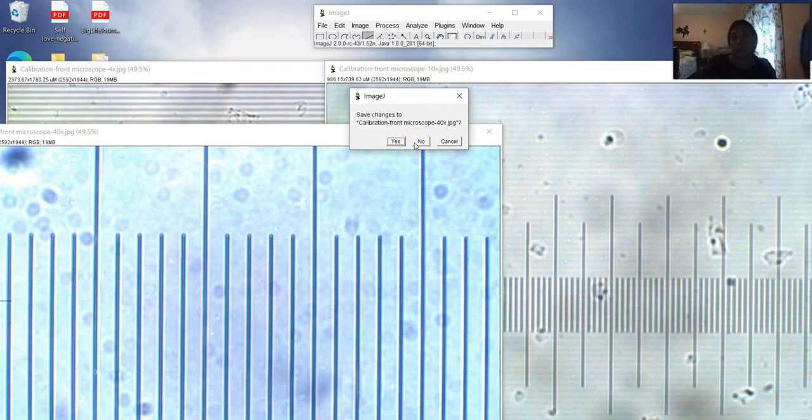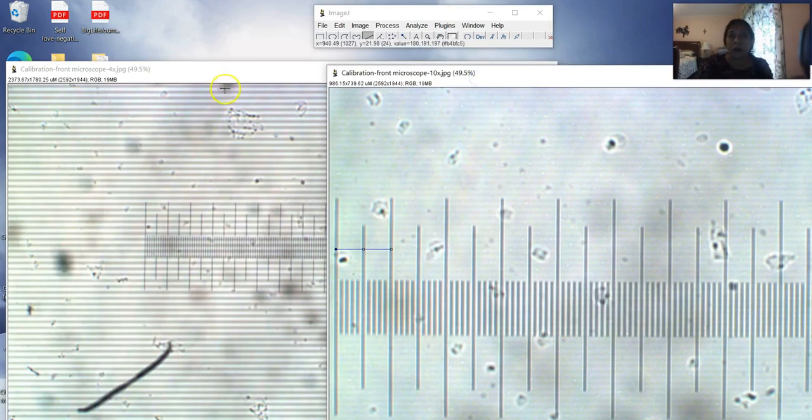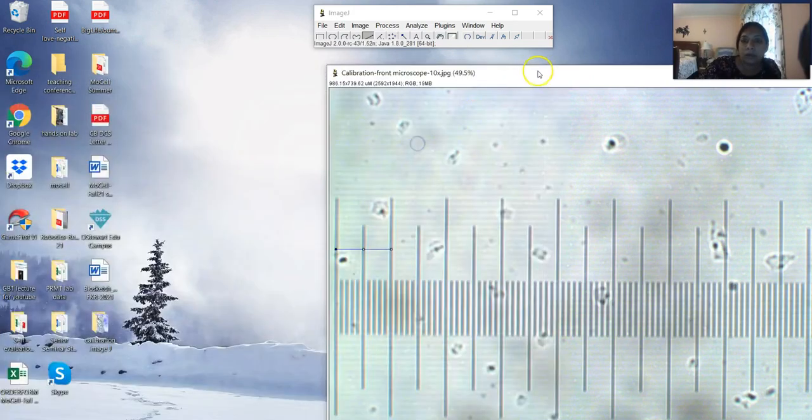We know what those are. We are going to go ahead and copy this number down, however, because we will need that, the 2592 times 1944, which is the resolution at the end of the day that we have in here. So I'm going to just say no, don't save anything.